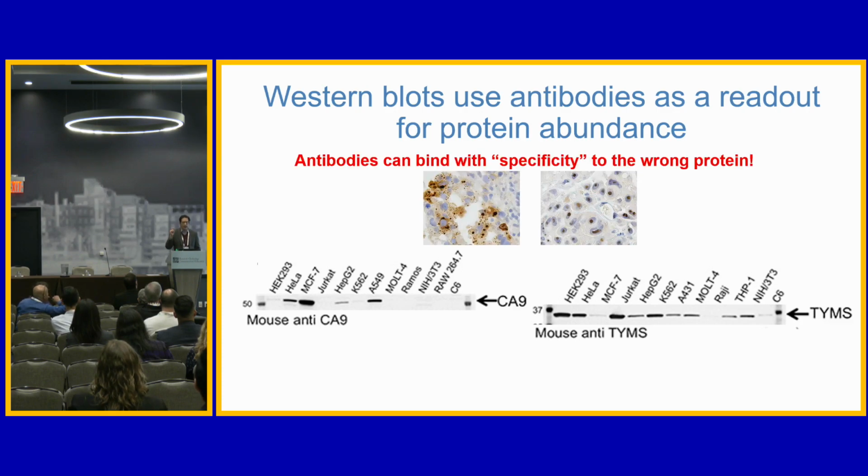So one example of that is IHC, right? Immunohistochemistry is a circumstance where you're washing a particular protein across a cell or a tissue slice, and you're trying to see what parts of that cell light up. And so you can get really specific binding, or what looks like really specific binding, to areas that just are not the protein that you're actually interested in with these types of measurements, because you are working off of a single binding event, right? A single selection event, okay? So what are different ways of getting around this sort of single binding event issue?